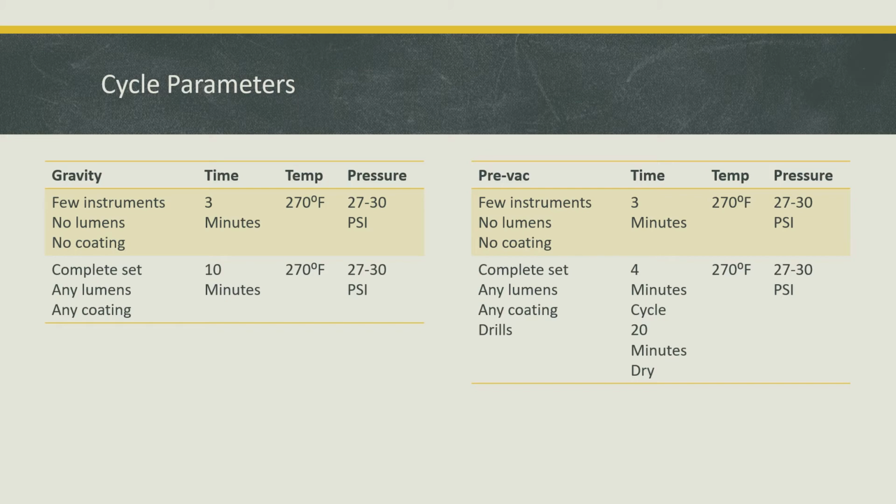And when the temperature would go up, the little graph chart would go up, but there wasn't a recording of the pressure. So you did have to monitor and check and make sure that the pressure went up to the indicated point, and then you would check on the graph the temperature and the amount of time.